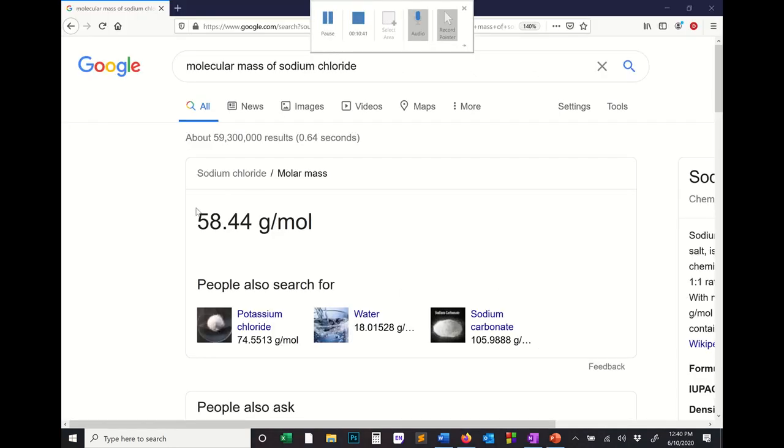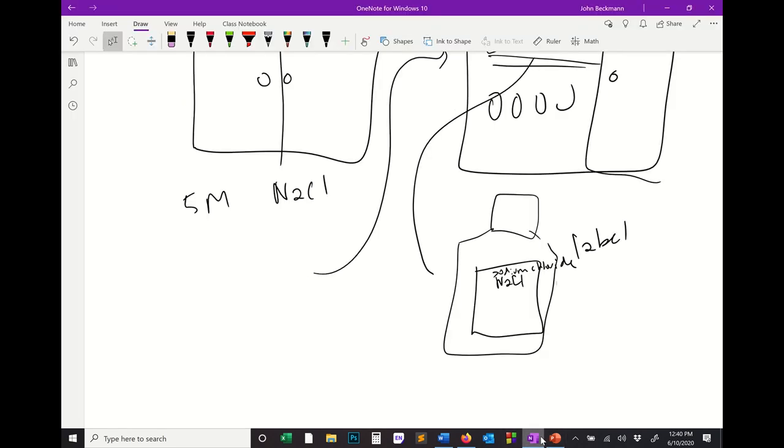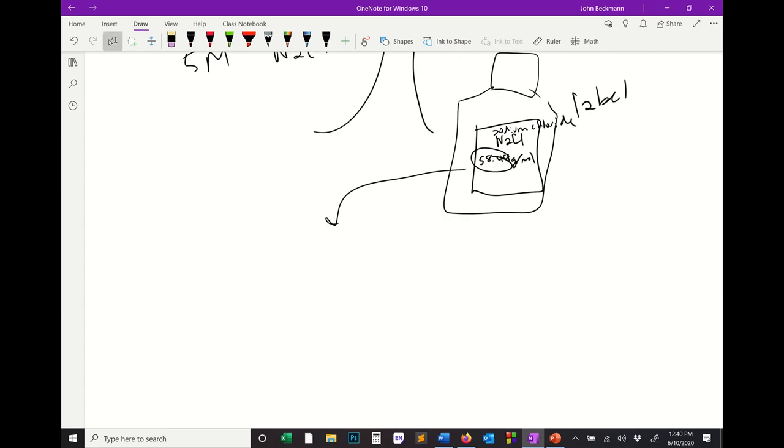And it's going to look like this. It's going to say 58.44 grams per mole, which is the molar mass of sodium chloride. What this actually means is, on that bottle, it's going to say 58.44 grams per mole, okay? And you're going to look at that and say, I now know how to make a 5-molar solution because I know how to make a 1-molar solution.